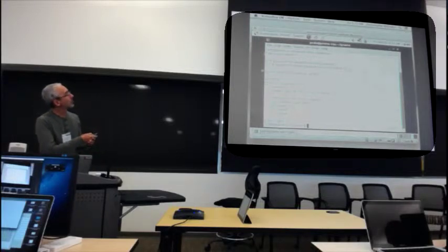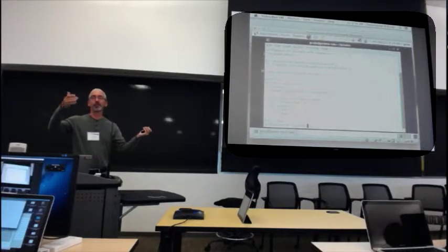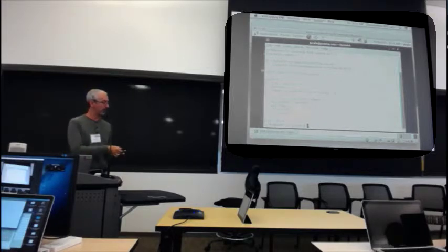What we're doing here is called Python, this little language. Again, it's similar in complexity to MATLAB. There's no compiling or anything like that, and it reads in a fairly straightforward way. The first line says, go get Psana. In the second line, this is where you would put your experiment name. If you're in an LCLS experiment, you get assigned an experiment name, typically something like CXI84914.